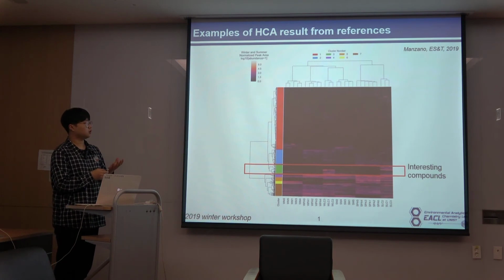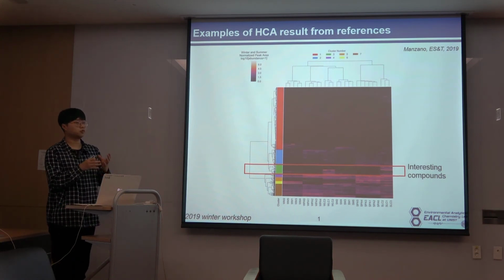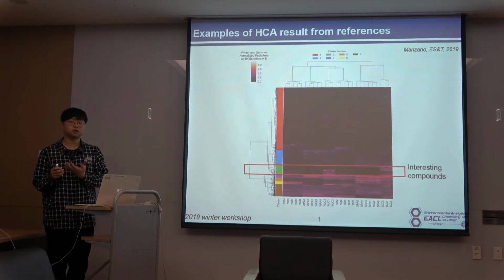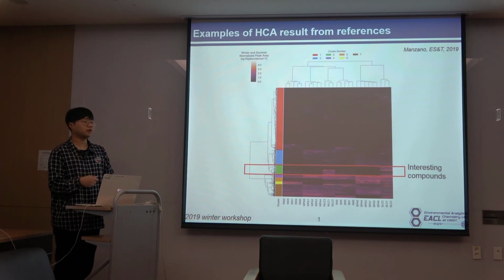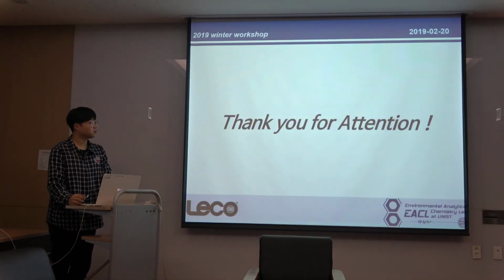So I think if we get a large data set from the analysis, this data mining or data processing from identified peaks, with some criteria for filtering, and finally we can conduct cluster analysis or some other statistical analysis. So maybe I will study these statistical tools more, and after that I want a more detailed interpretation of this analysis. Thank you for listening.